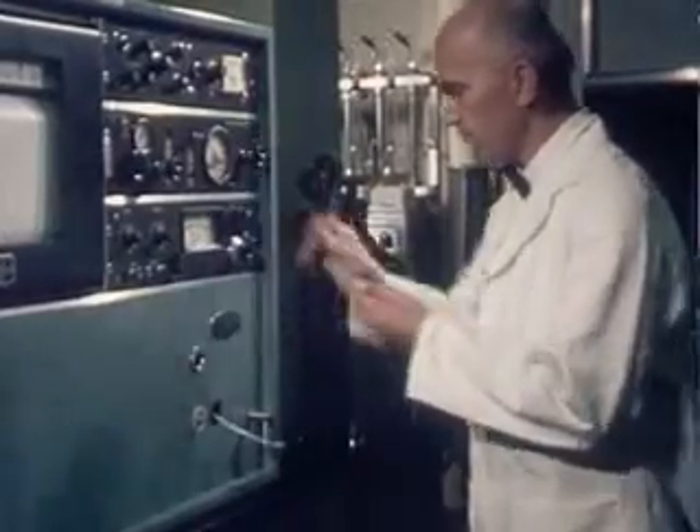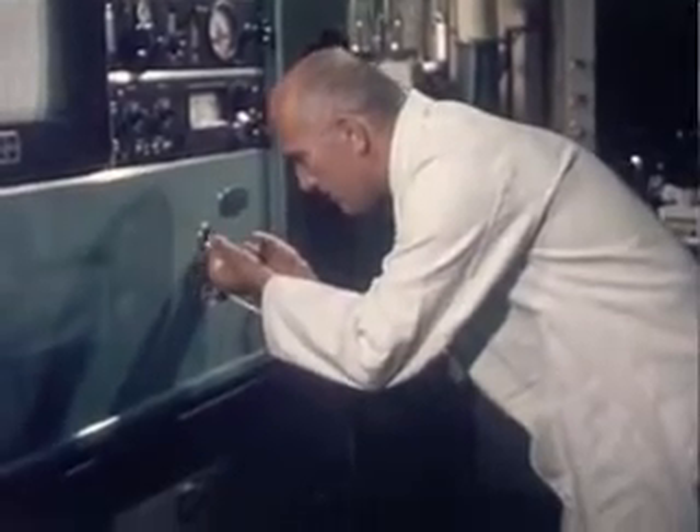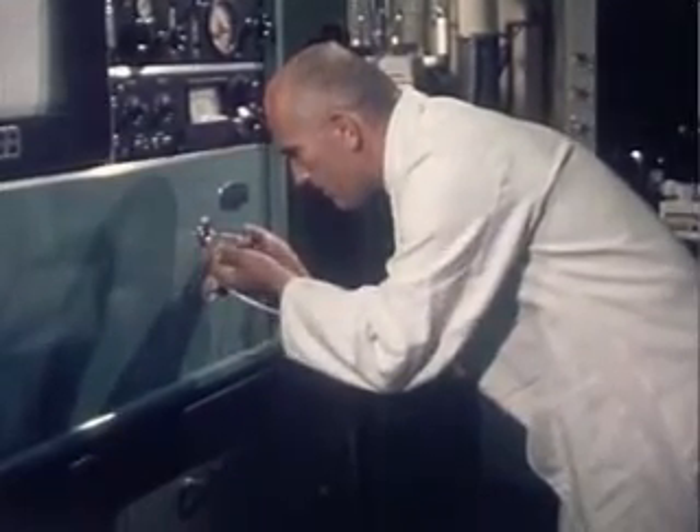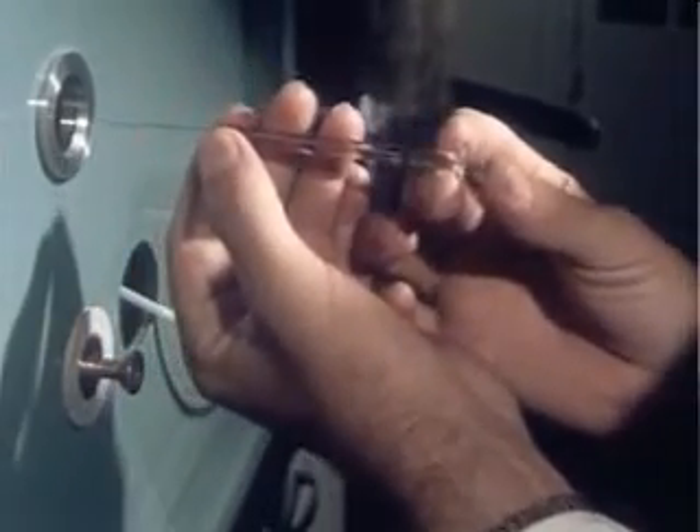When chemicals are shown to be present, another machine — a gas chromatograph — can be used to determine how much. This device is so sensitive that minute traces, even one part in a million, can be recorded.